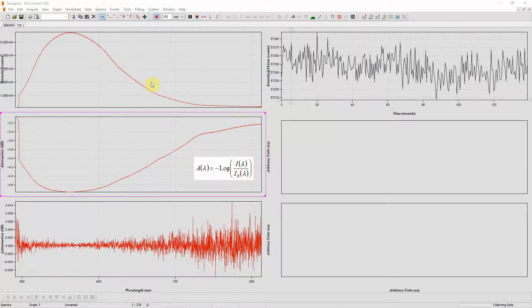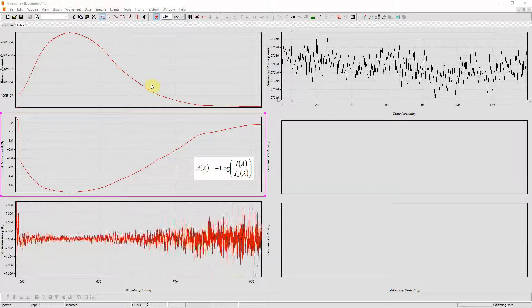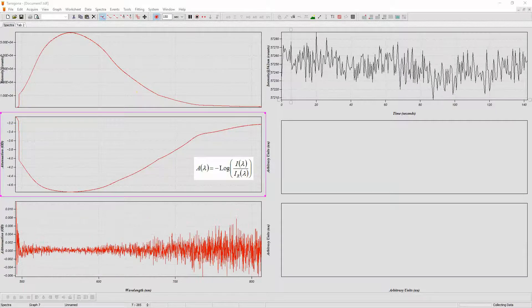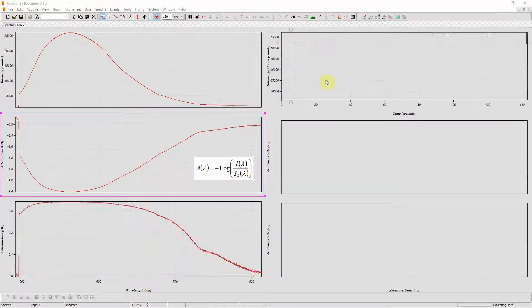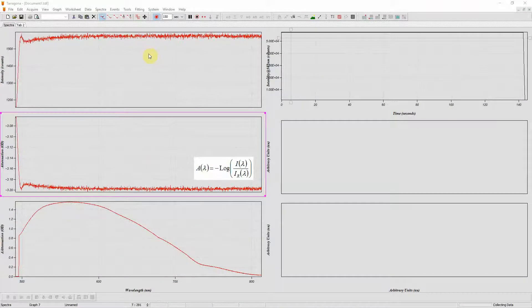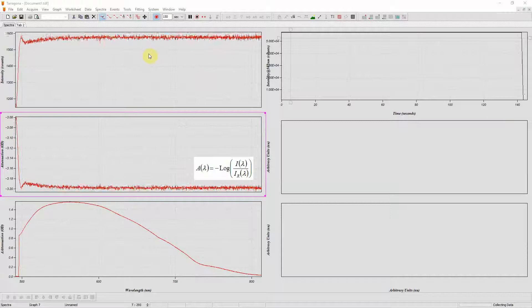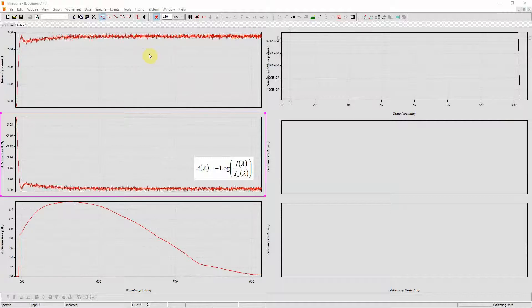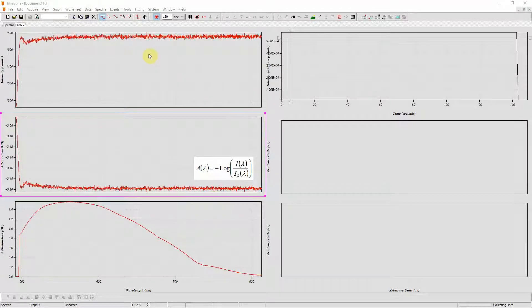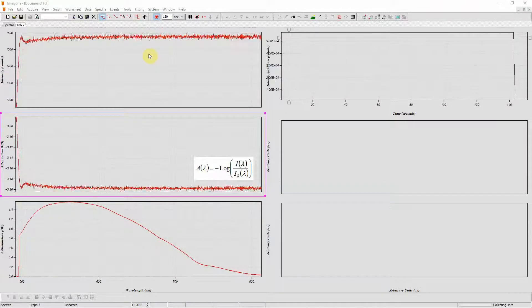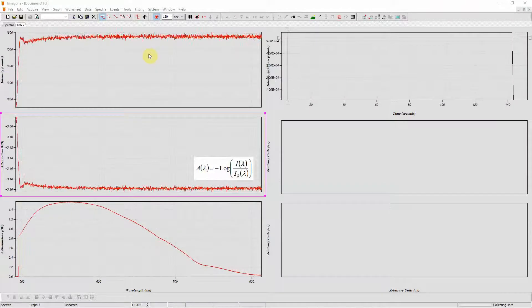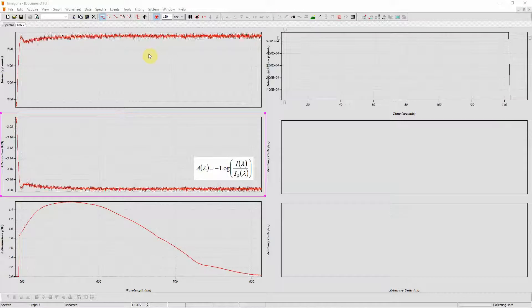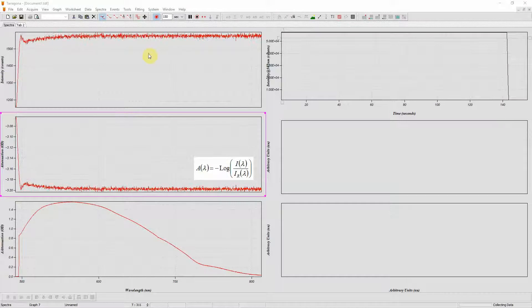First I need to talk about the black level. If I turn off my light source I can still detect the spectrum even though there's no light falling on my detector. So the intensity spectrum with the light source on has an offset and is not proportional to the light passing through my sample.